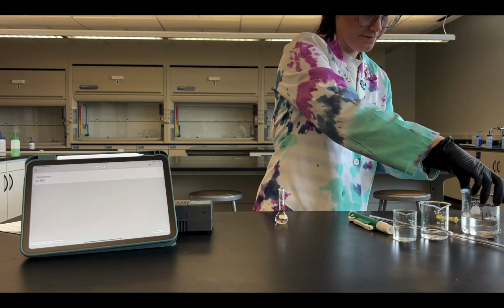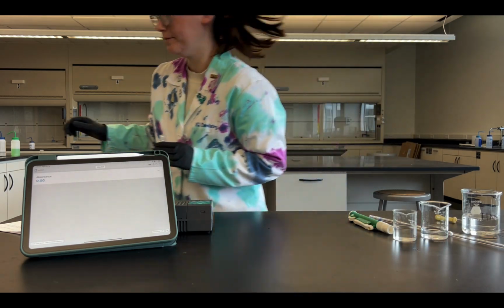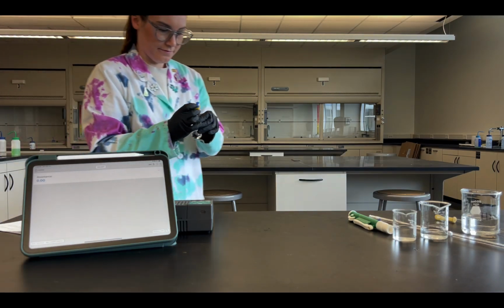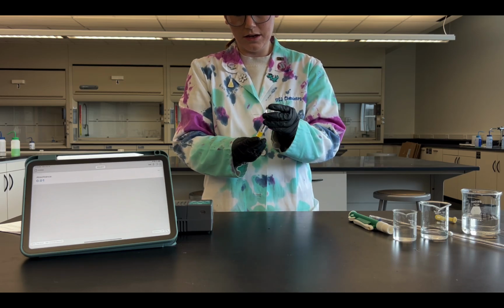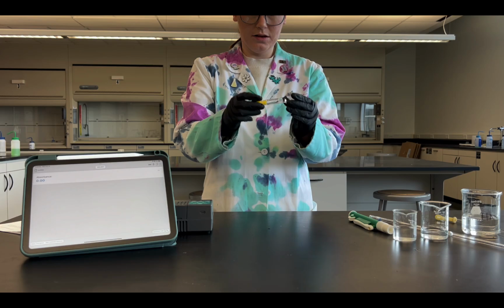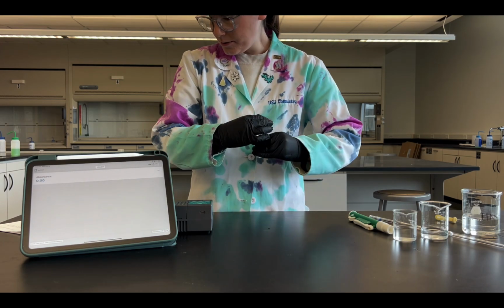Okay. Oh, I forgot a lid. Hold on. Here we go. Put my lid on there, and we are going to just mix that up. Okay.